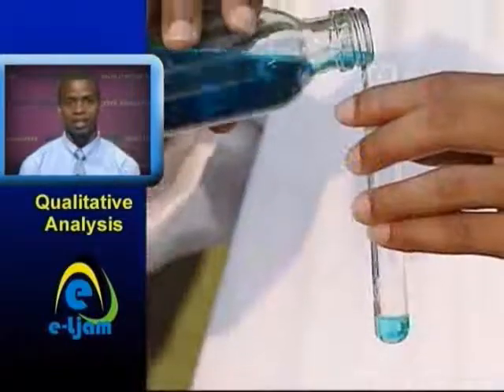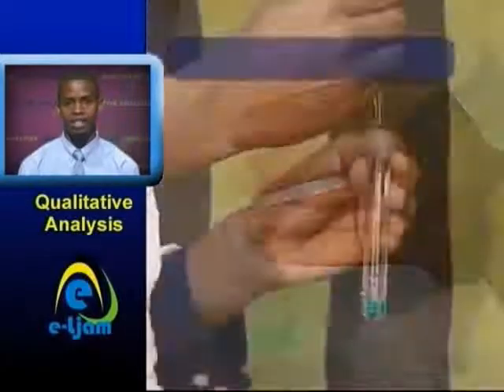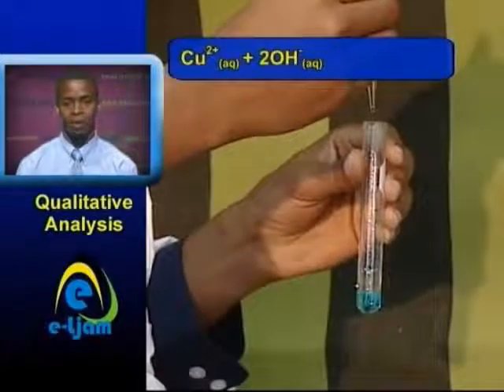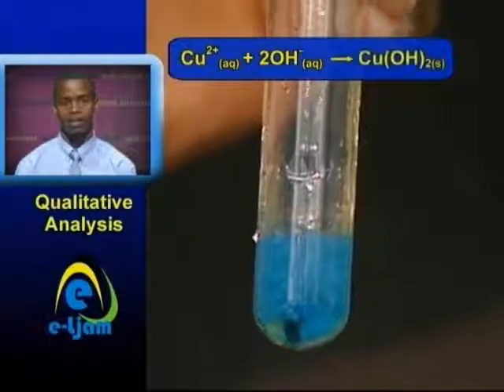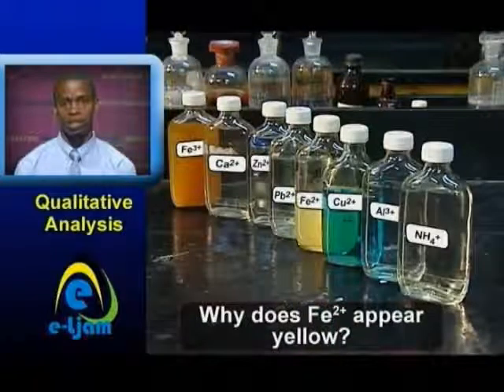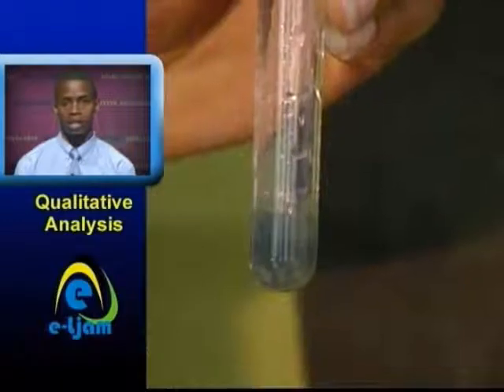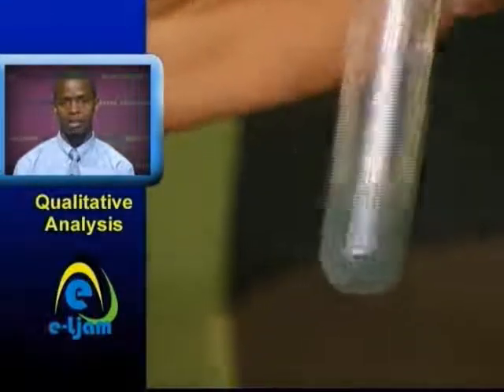Since most methods of qualitative analysis deal with ions, it is useful to keep in mind some of the properties of ions. 1. Ions can form insoluble compounds with other ions. 2. Their color or lack of color in solution or solid state is a fairly accurate indicator of the nature of the substance. Based upon this, if the compound is black, it is probably an oxide. If the solid or its solution in water is colored, this indicates that a transition metal ion is probably present.